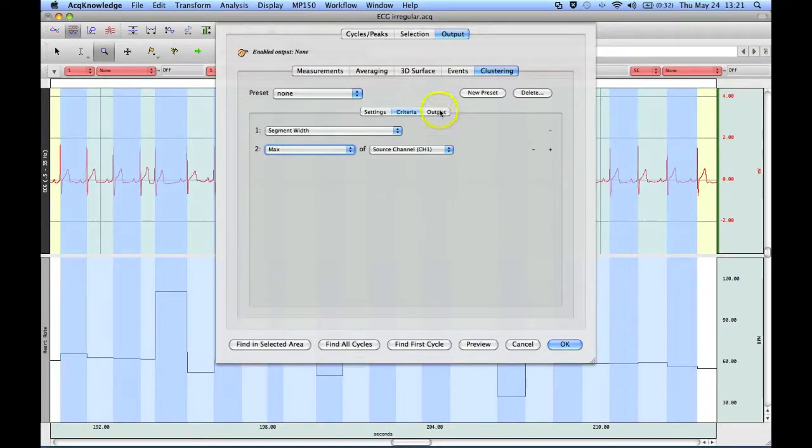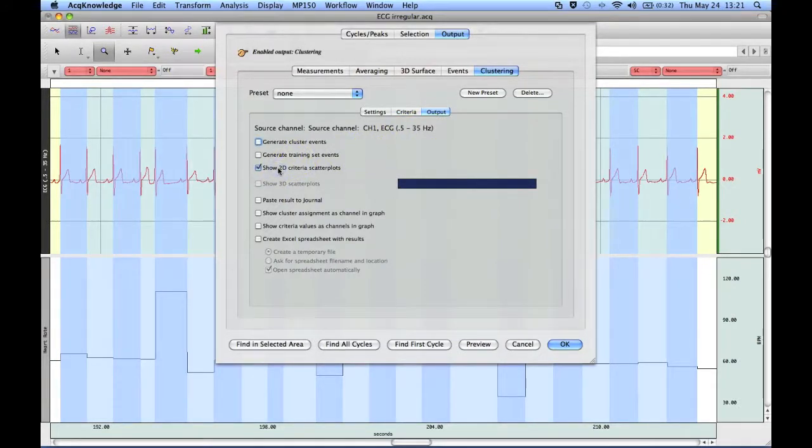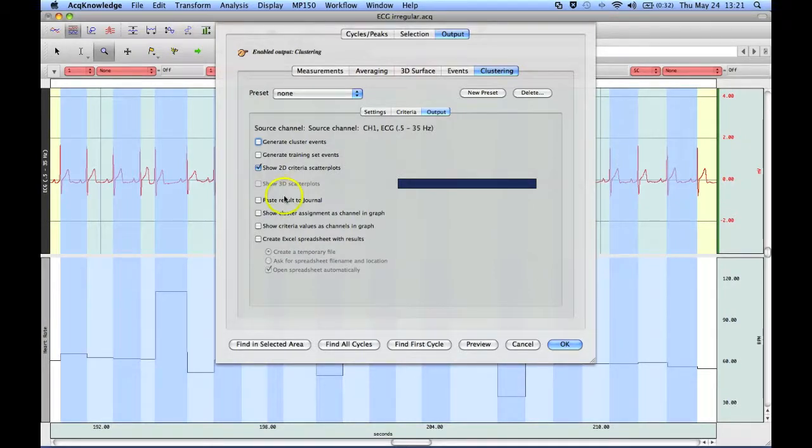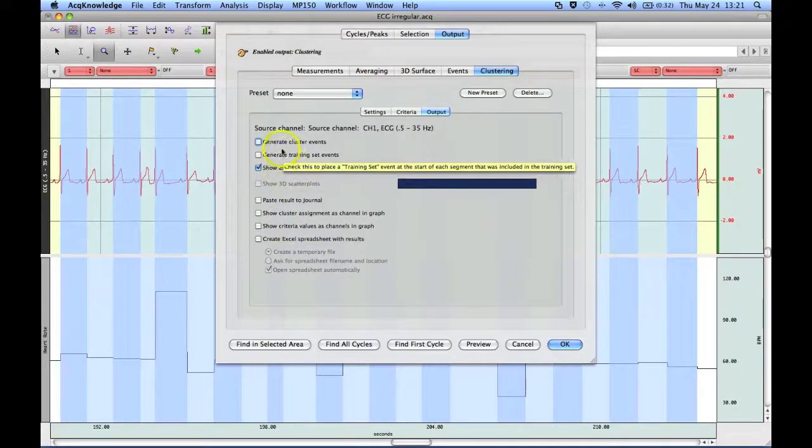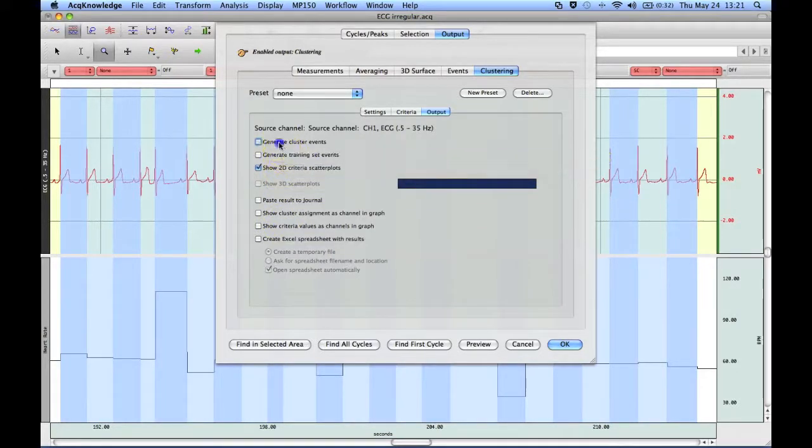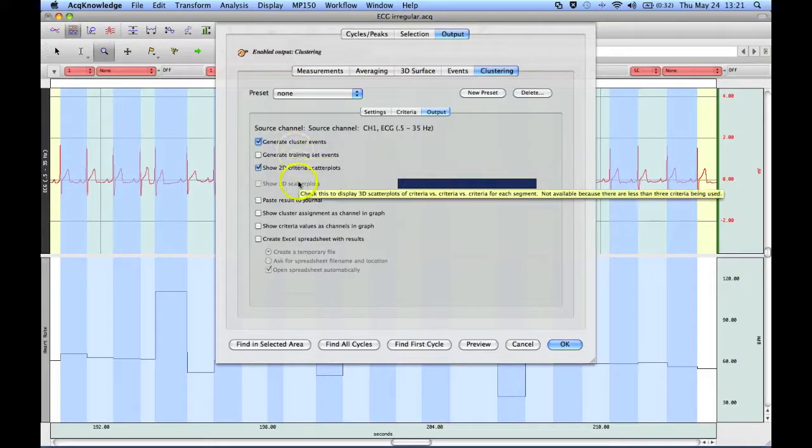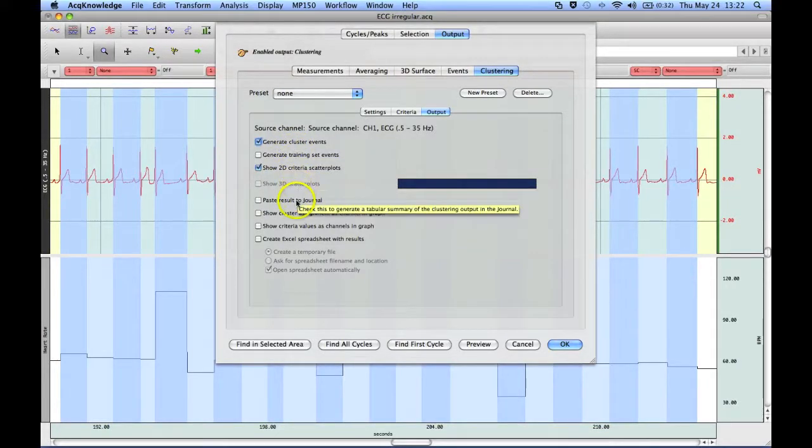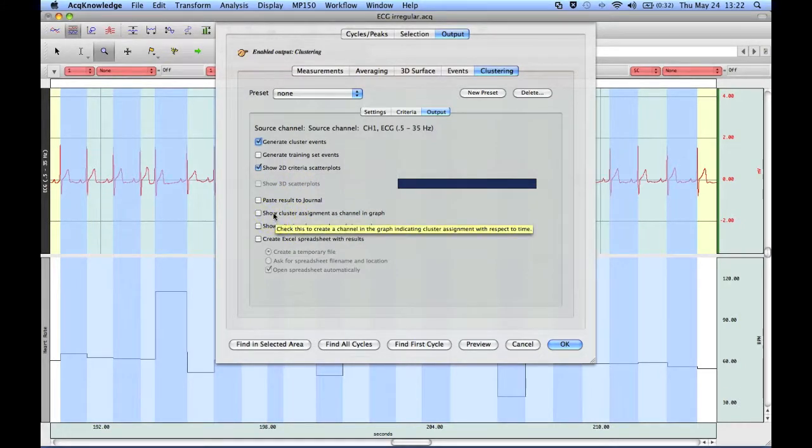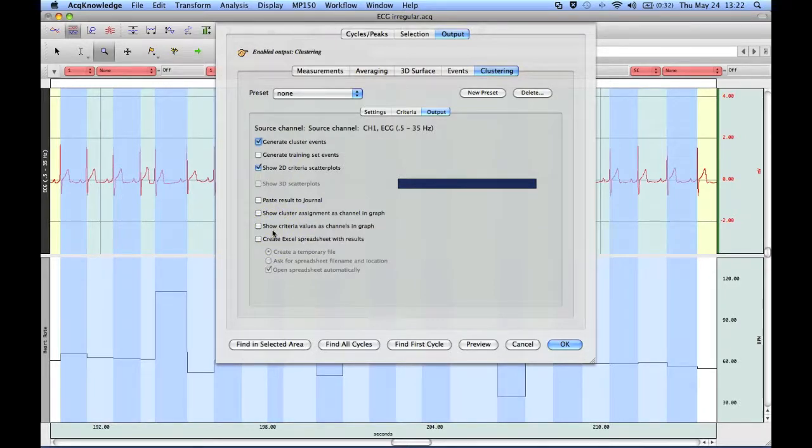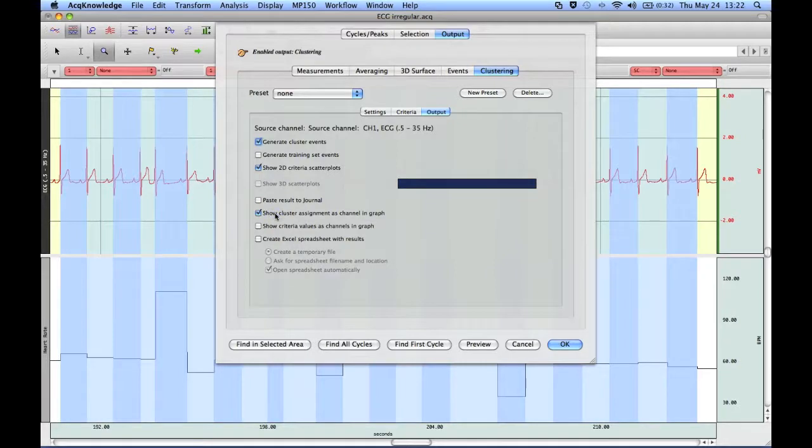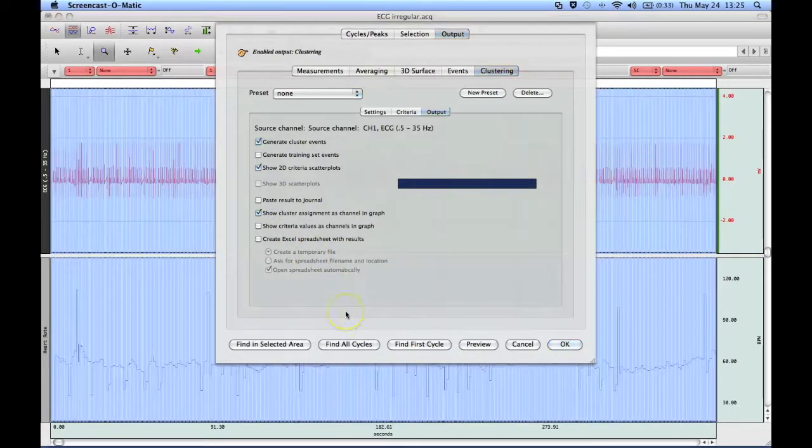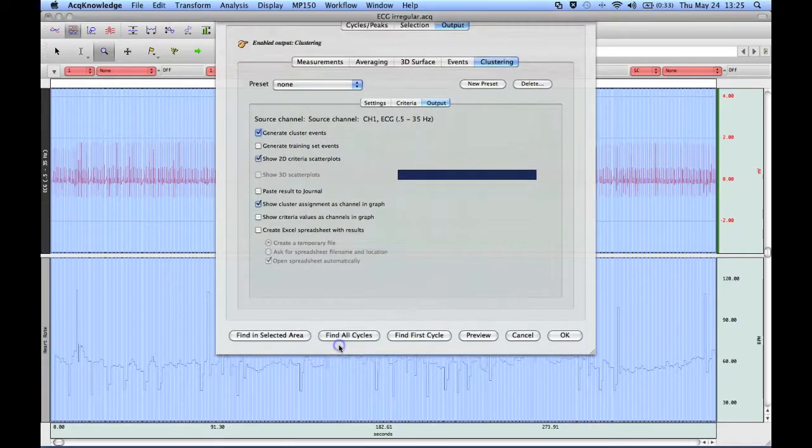My output, I'm going to show a 2D criteria scatter plot. And then I want to show, and I'm going to generate the cluster events. And there's an option down here to show the cluster assignment as a new channel in the graph. Now, we've made the appropriate selections, we're going to find all cycles.